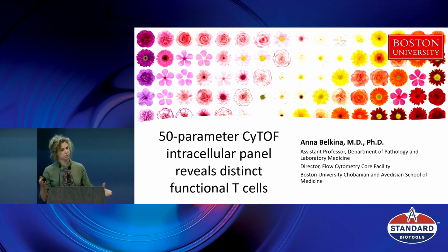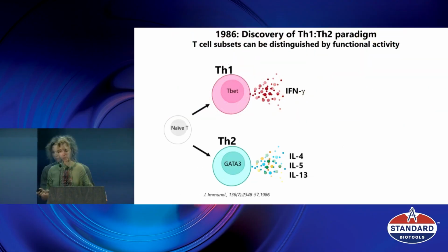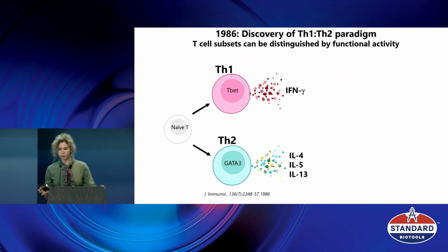My talk is titled 50 parameter CyTOF intracellular panel reveals distinct functional T cells, but I'm going to walk you through the whole journey, how we got there from smaller panels to larger, and how we assess different avenues of methodologies to reach the point where we are now. And I wanted to start historically.